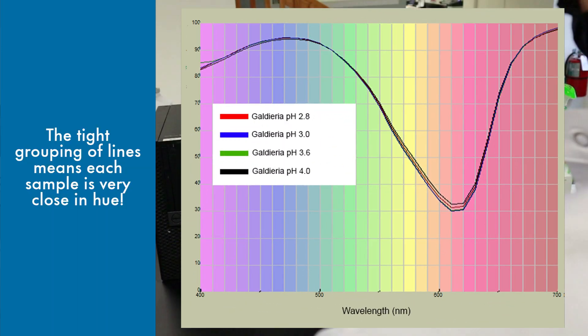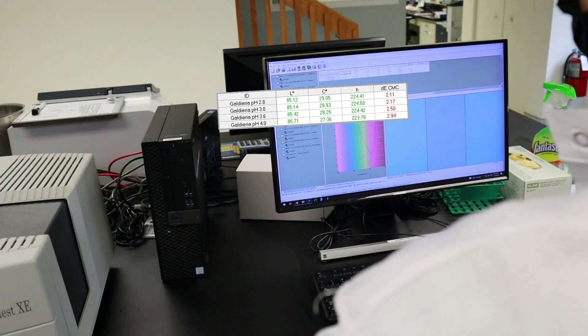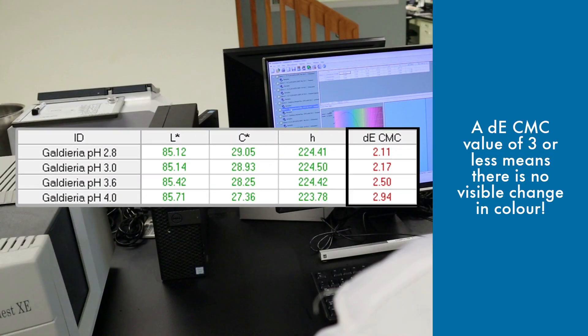As you can see, Galdaria was stable down to pH 2.8, making it a great option for natural blues in acidic applications like beverages and confections.